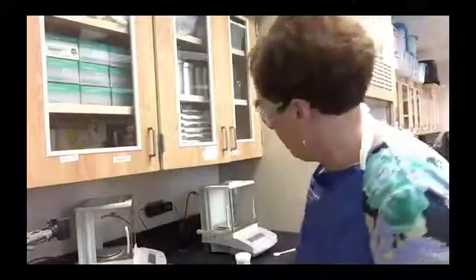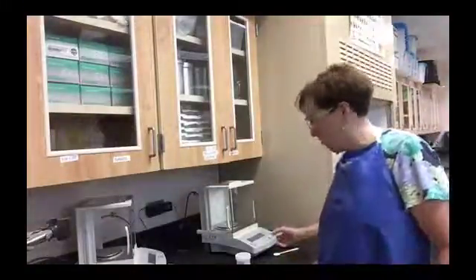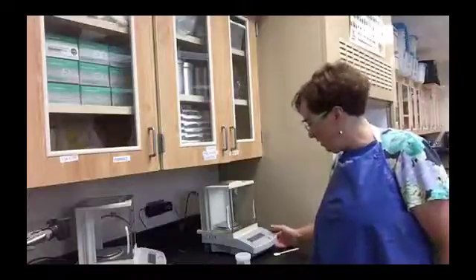In this video, I'm going to show you some of the techniques required for the Hydrate Lab. We're going to be using these electronic balances — I'm sure you've used them before — so the first thing you want to do is tare the balance.